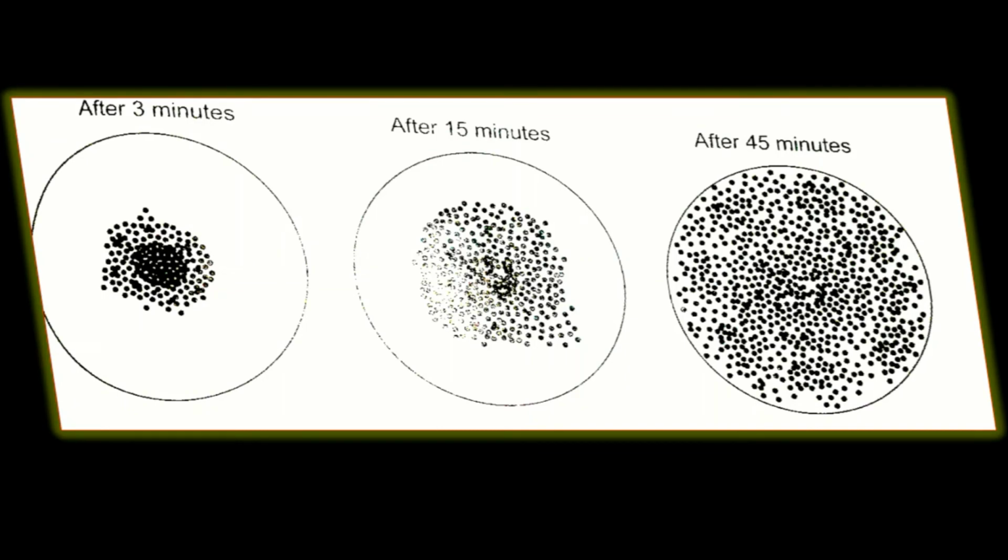So in short, what is going on here is that you have your solute, which was placed at the center of your petri dish, and because this is where it's highly concentrated, it will start to move to where it's in low concentration. It's highly concentrated at the center, and it's in low concentration in these parts where our cursor is moving.